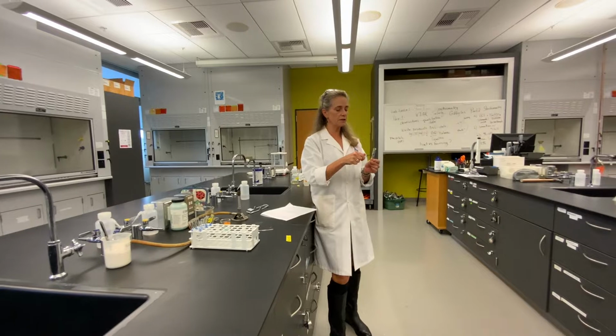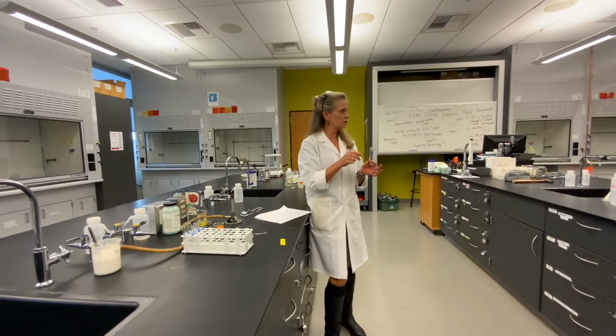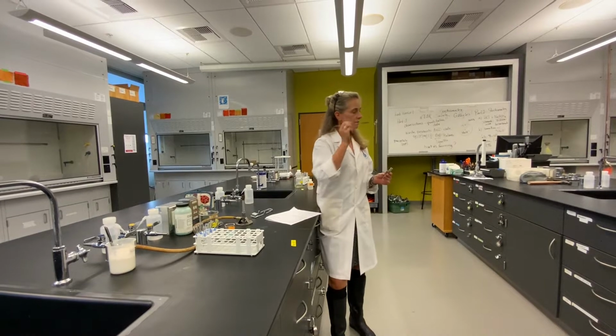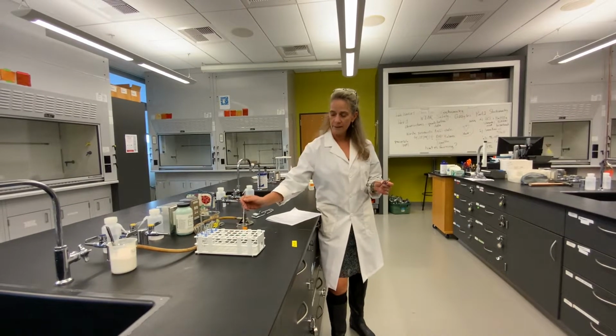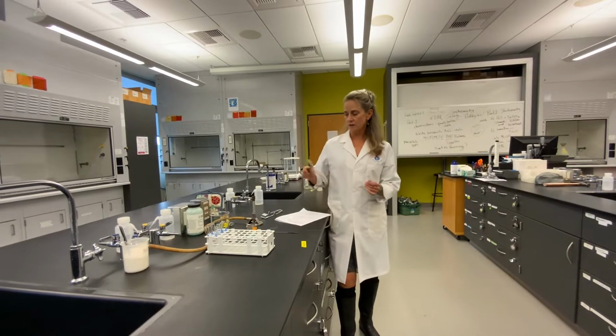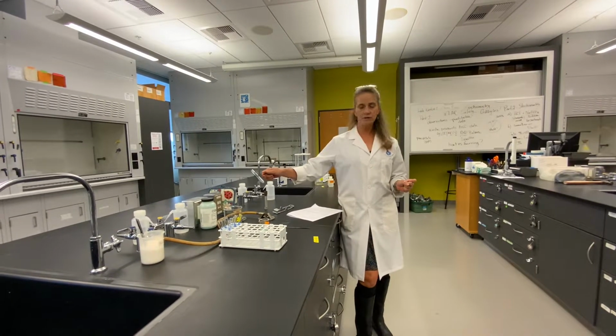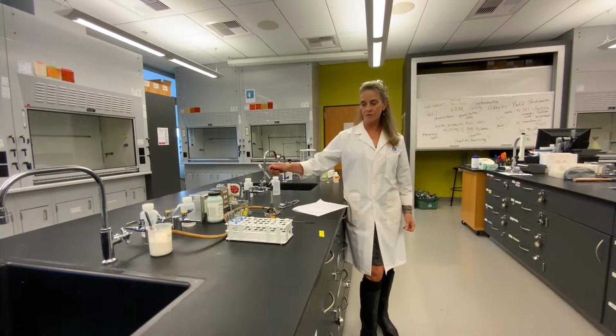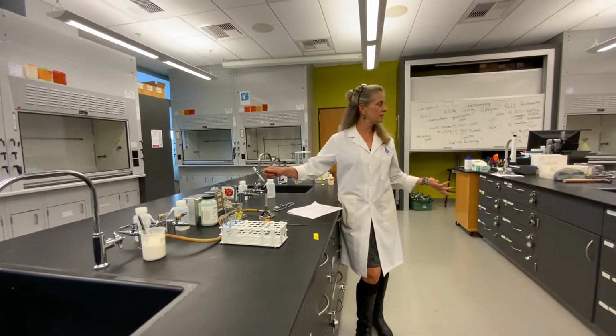So basically you're going to use the test tube holder and hold on to the test tube. You're going to put a very small amount, using this spatula, of copper carbonate in the test tube, all right? And then you're going to, again, use those good policies of turn the test tube away from you and hope nobody's standing over there. It goes in the flame for a brief time till you see a color change.